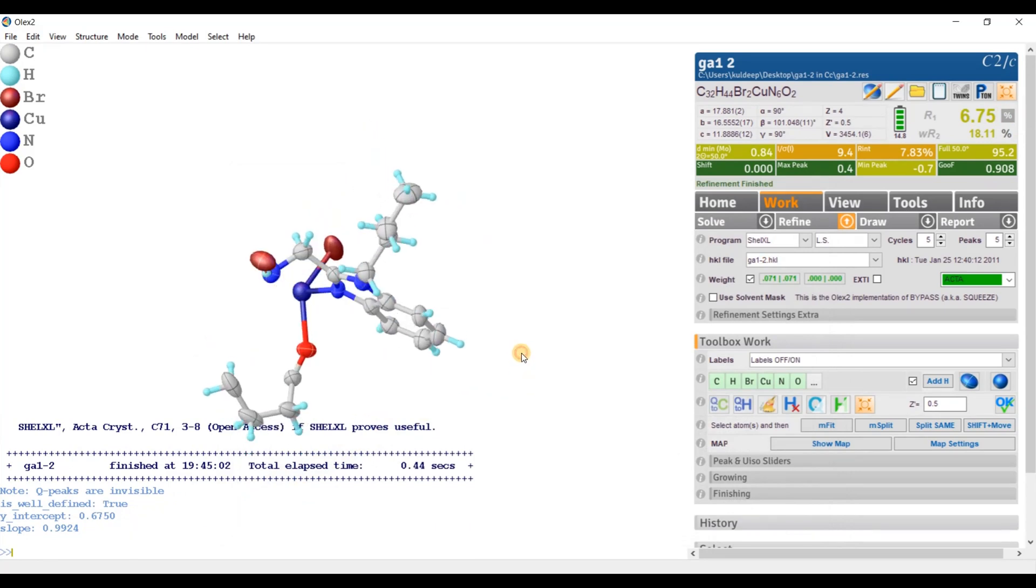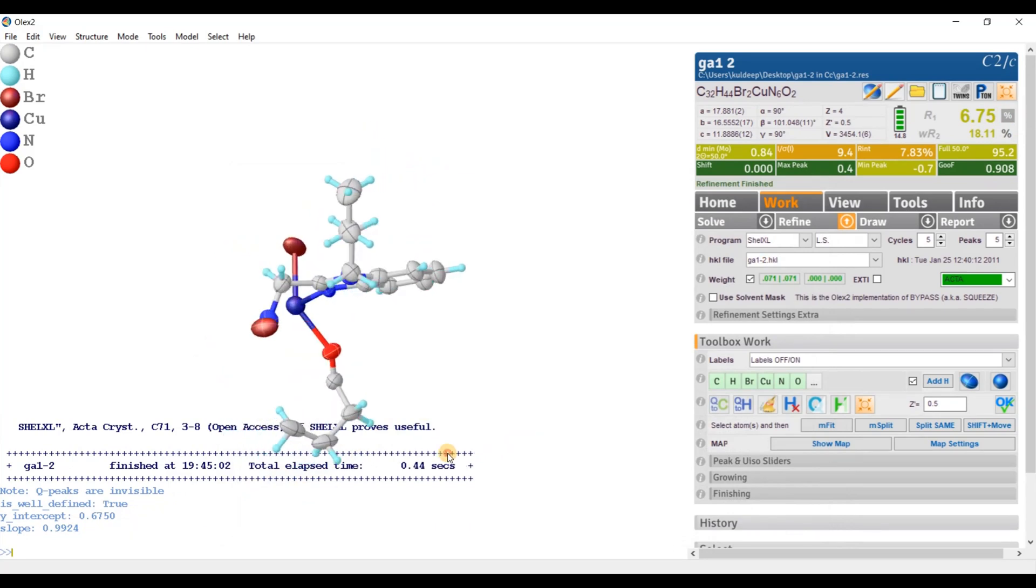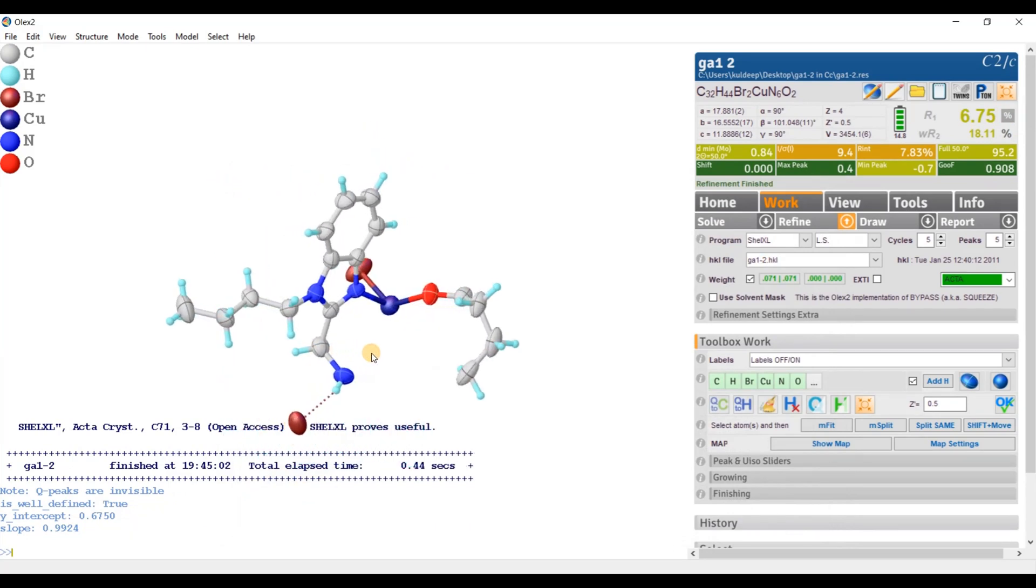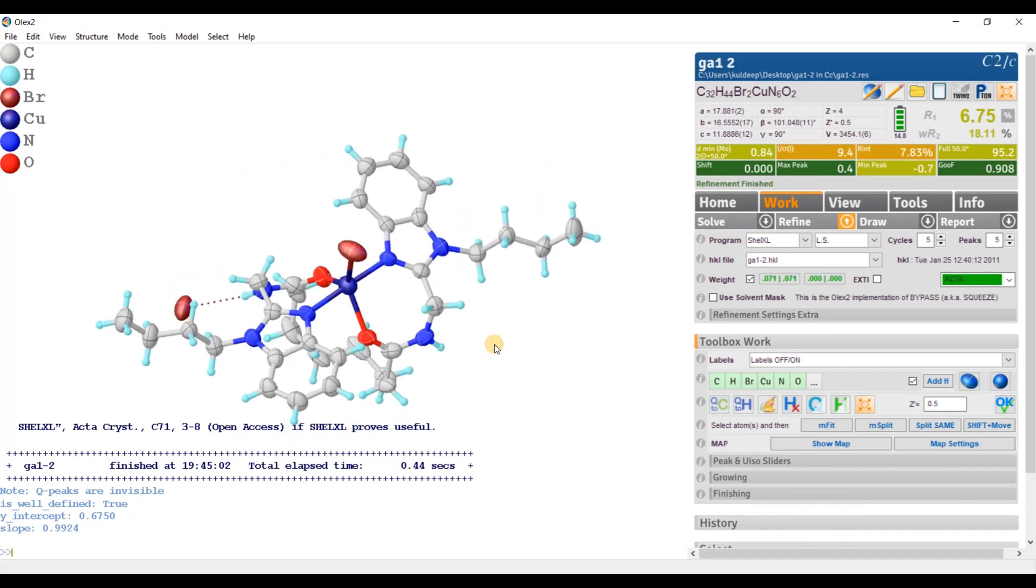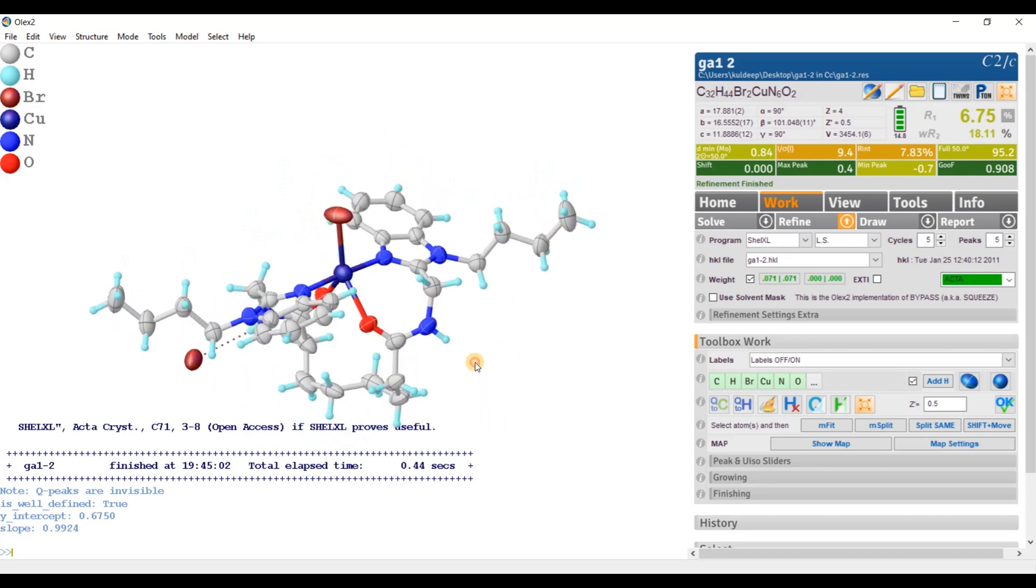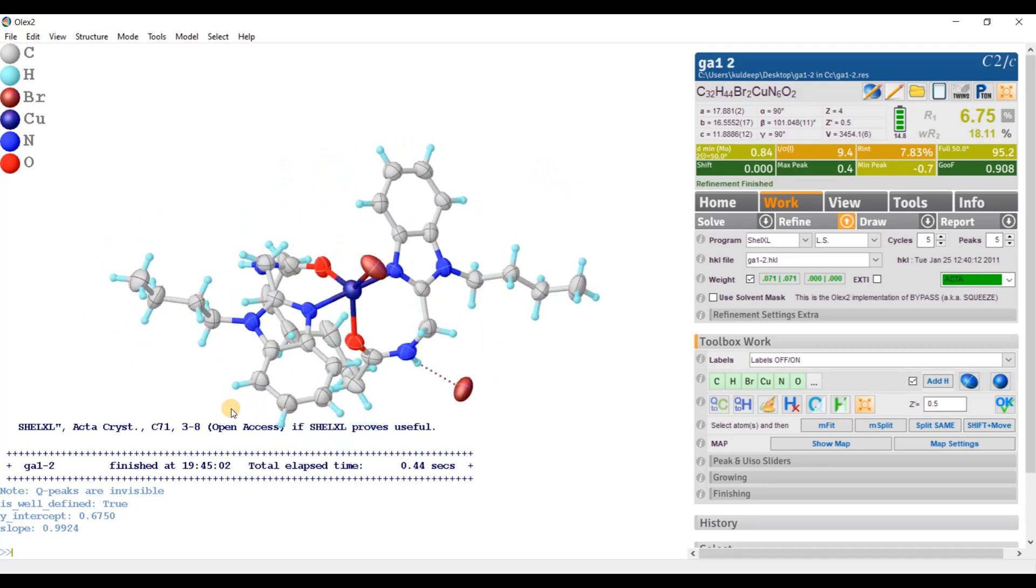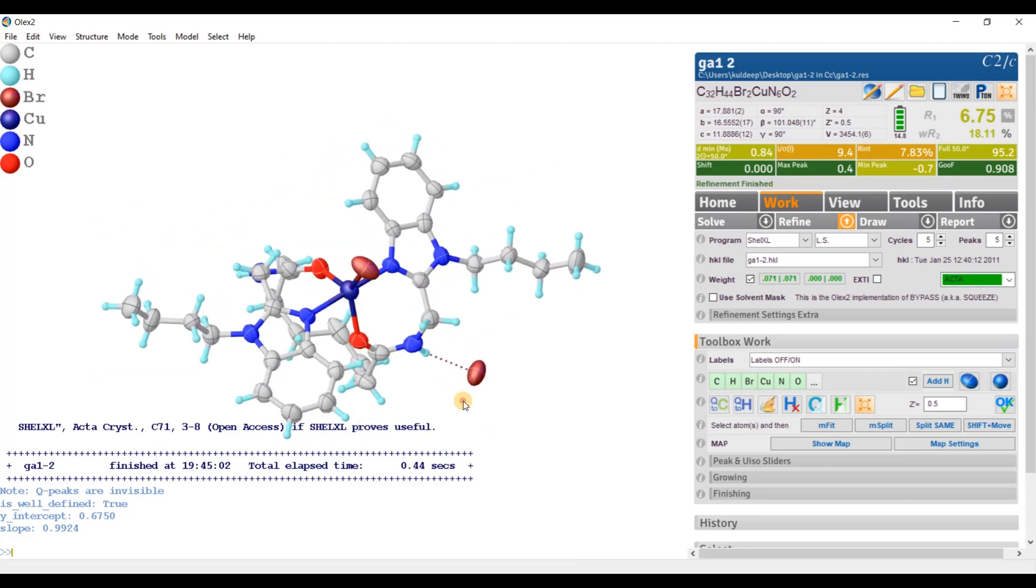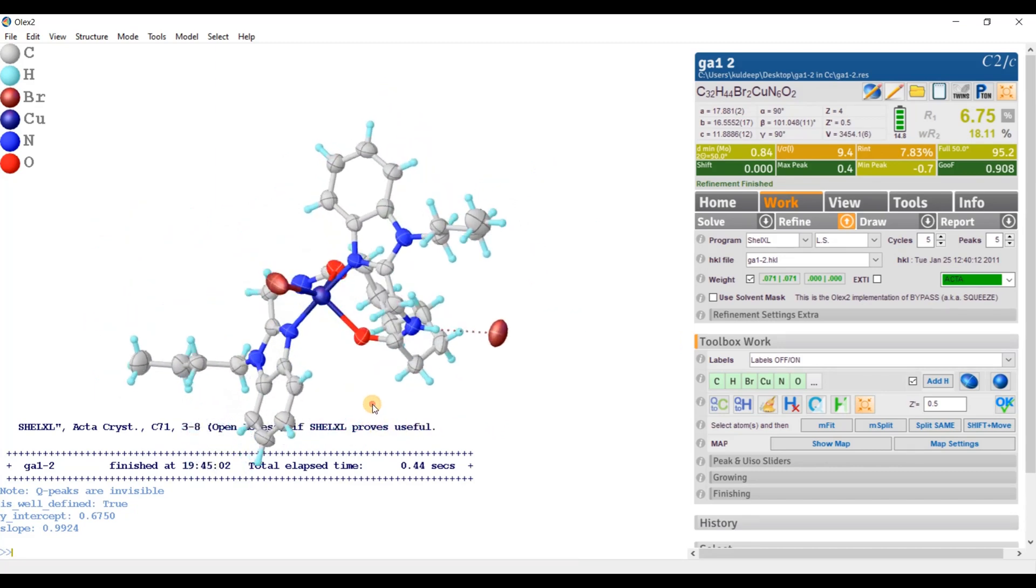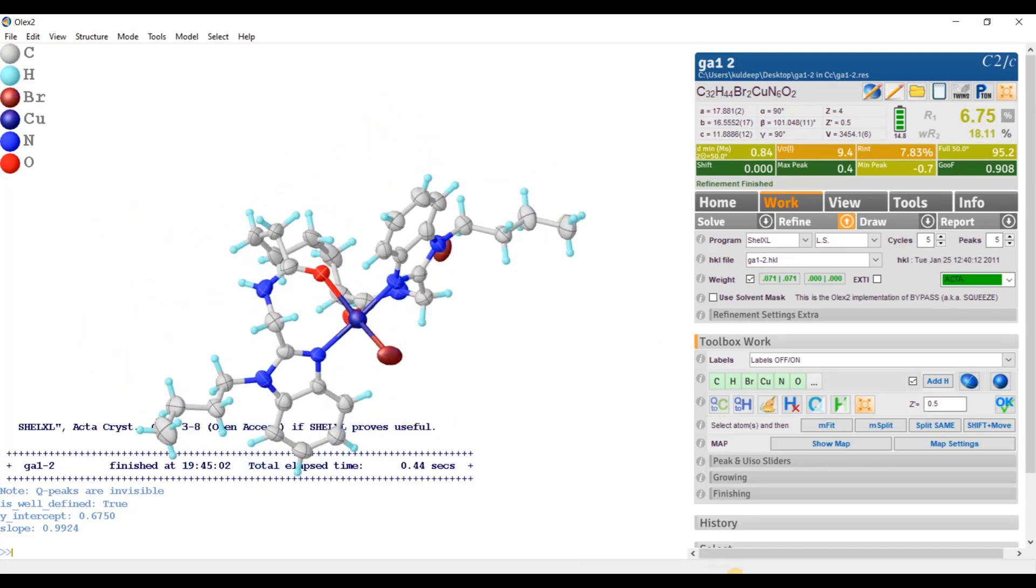Okay. So if I am going to generate the whole structure, just type grow. And this is the complete structure. Okay. So if now I am going to open this file in Mercury for the visualization of the symmetry element, what I have to do? I am going to open Mercury.